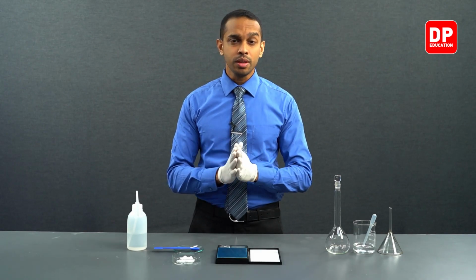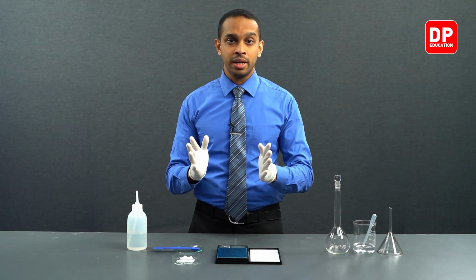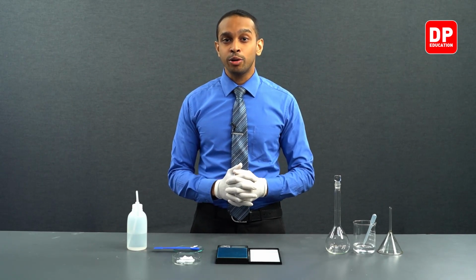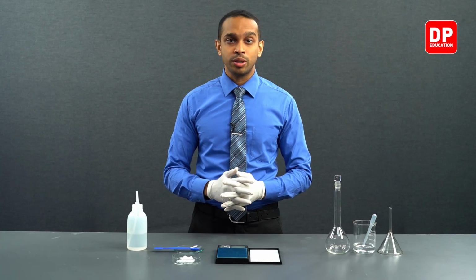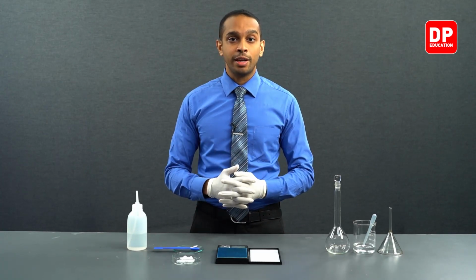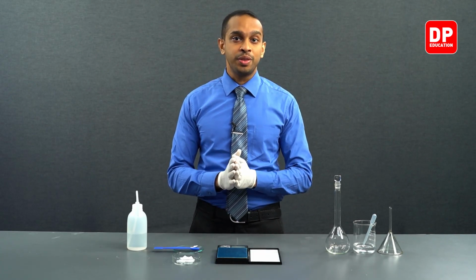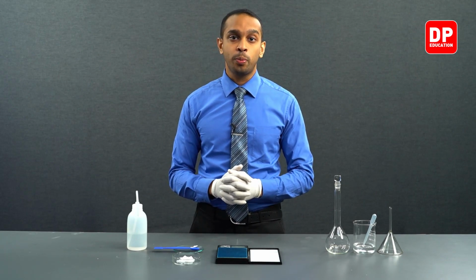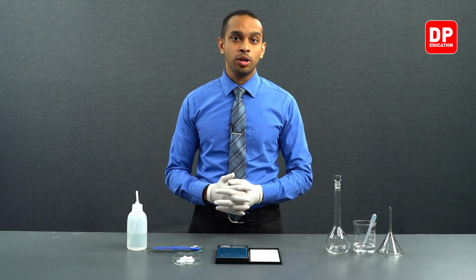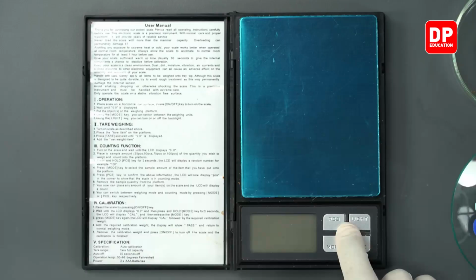And then if you know the molar mass of potassium oxalate, you can use the number of moles and the molar mass and calculate the mass of potassium oxalate needed. So we have already done the calculation. The mass of potassium oxalate that we need for this titration is 2.08 grams. Let's move on to measuring that 2.08 grams.